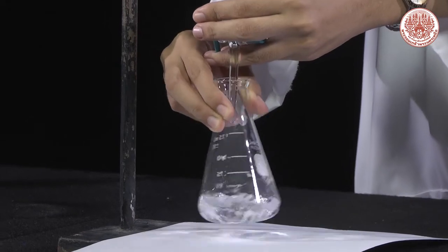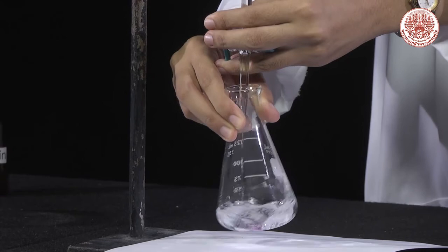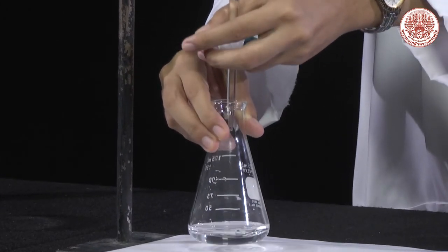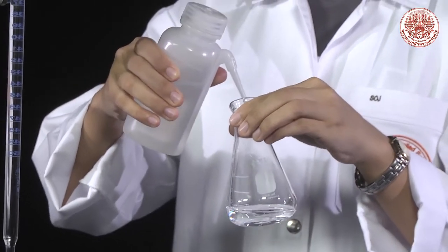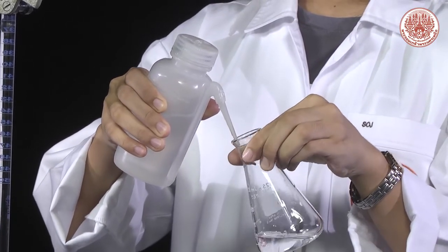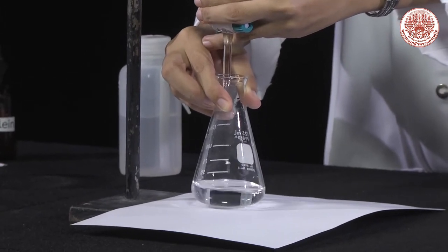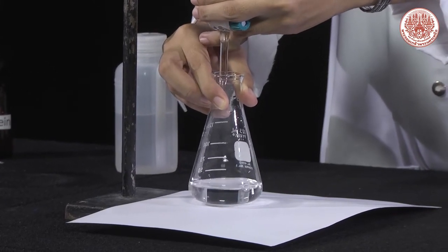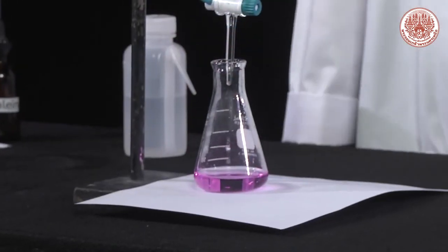When the equivalence point is close, the color of the indicator will be seen when the titrant hits the solution in the flask, but the color disappears upon stirring. At this point, students may wash the flask with distilled water and continue to titrate, and stop when the solution in the Erlenmeyer flask turns from colorless to pale pink. This is considered as the end point.